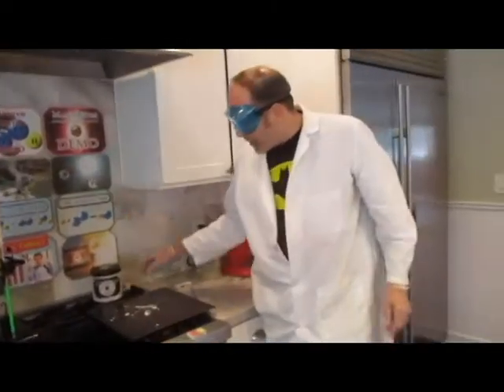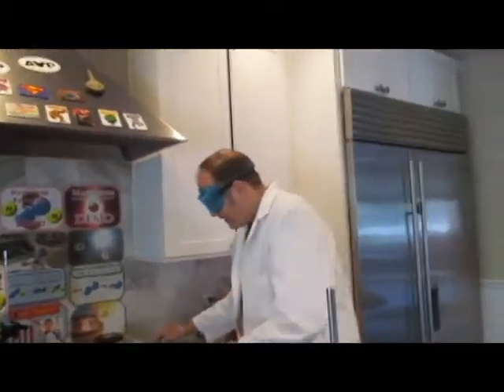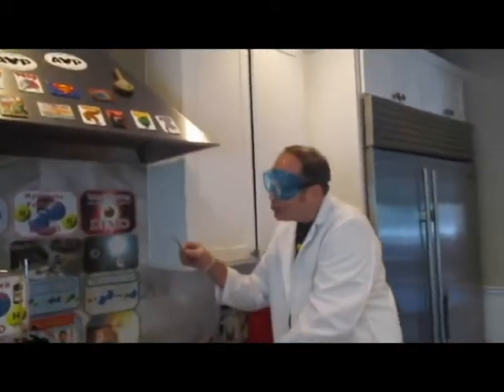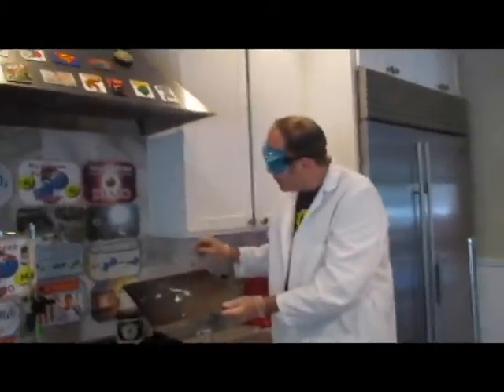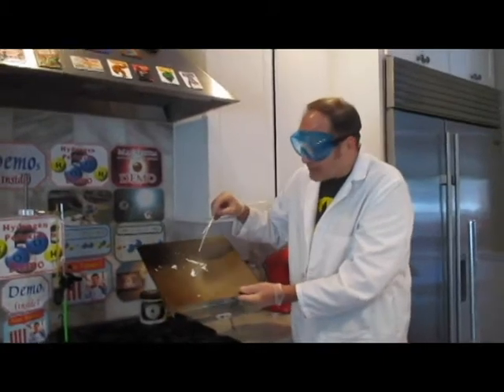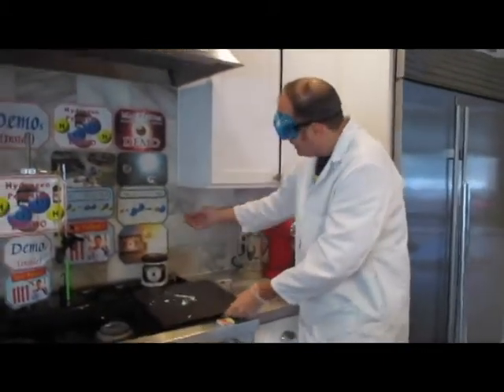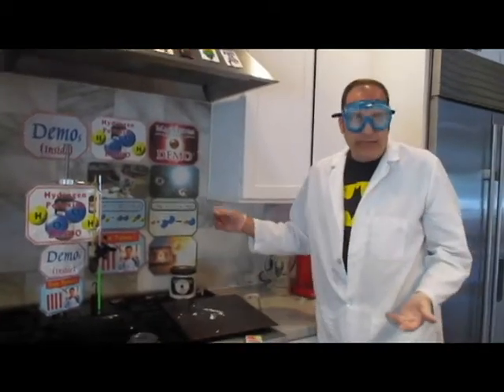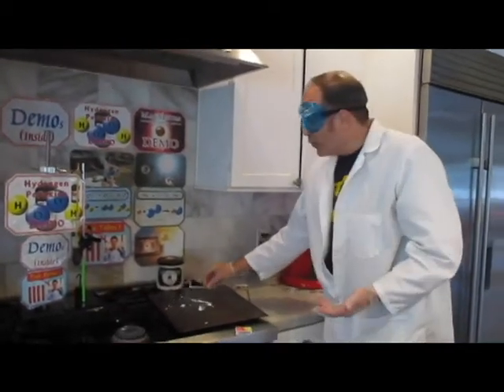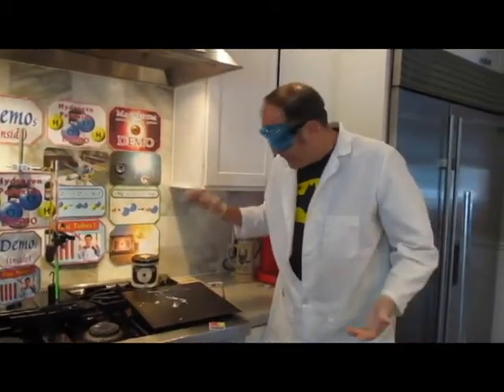And notice how bright that was. Depending on your distance, I'm a little dazzled right now myself. That was as bright as the sun, and I did 2 ribbons, so it was kind of like a binary star. Well, there's the magnesium oxide. Lots of chemicals oxidize, and then they form compounds with oxygen. Lots of chemicals react with oxygen. Magnesium is no exception.